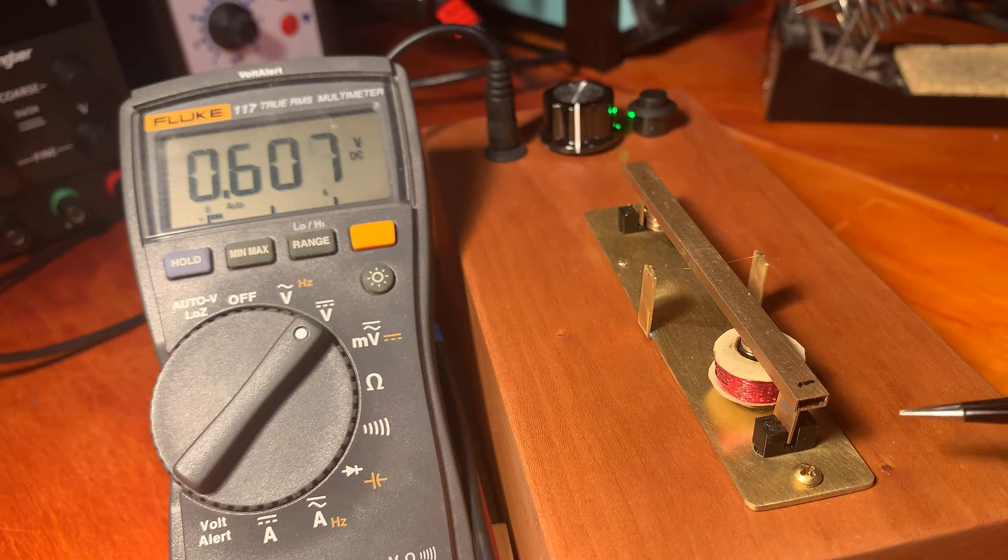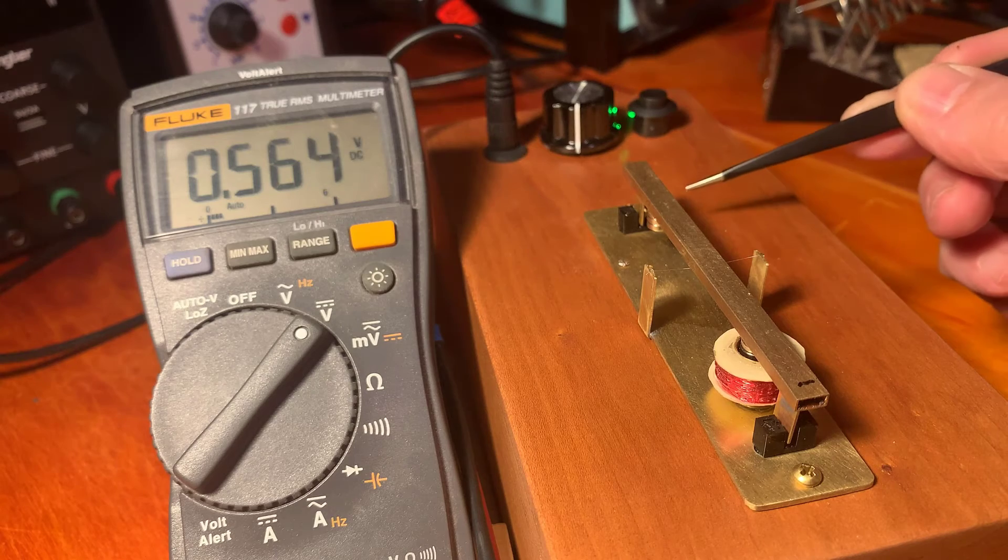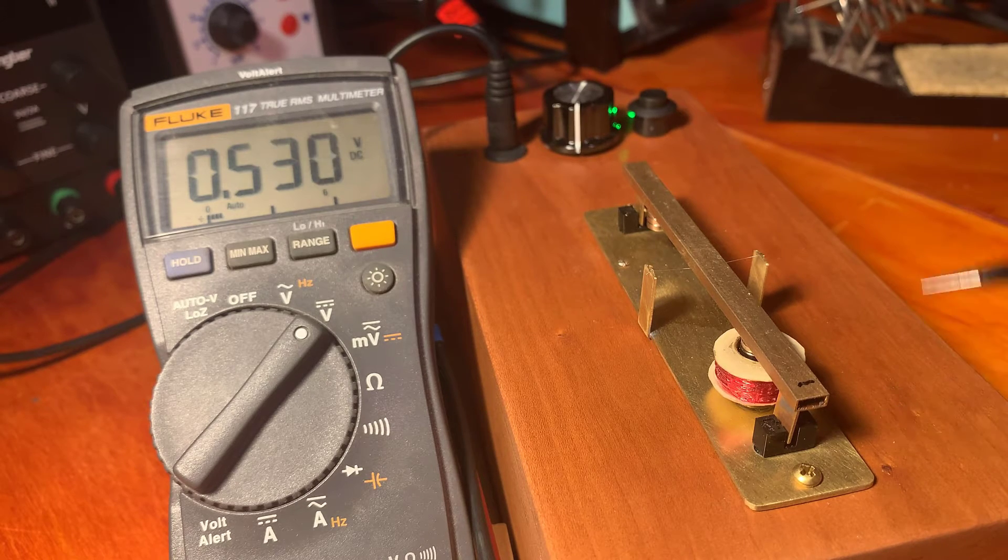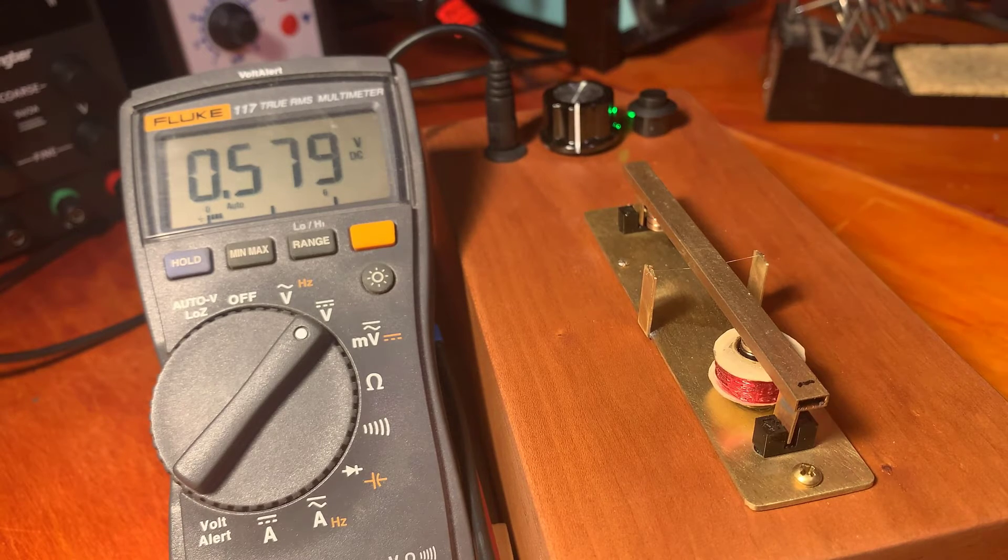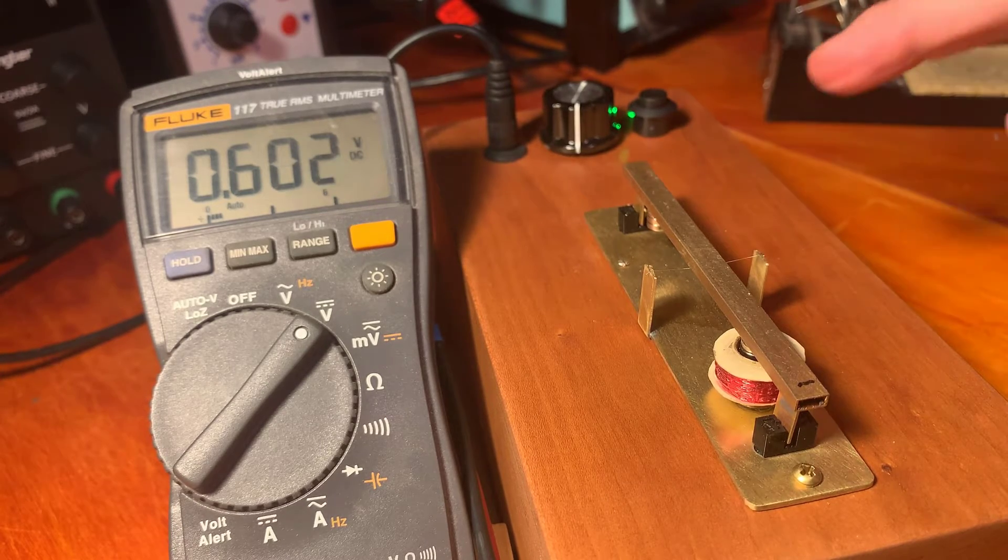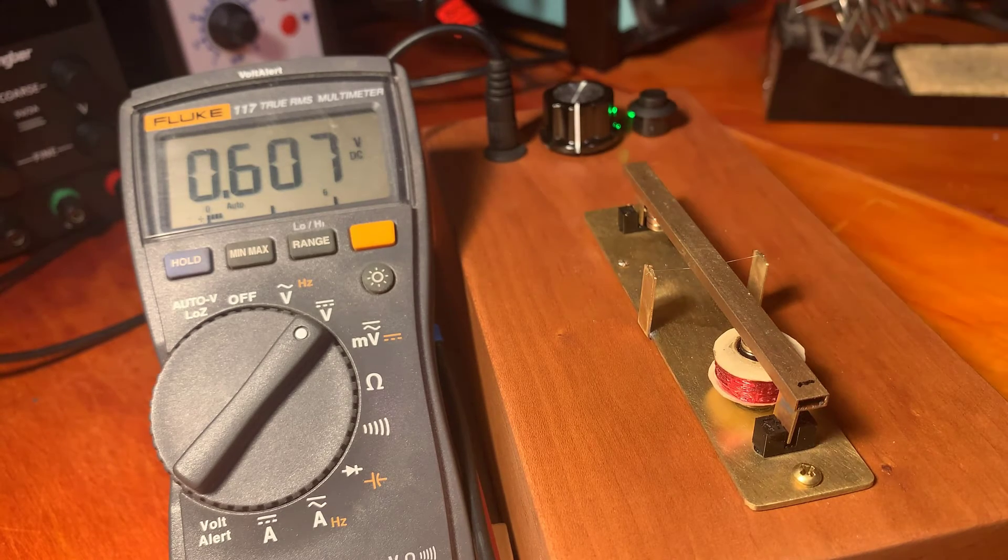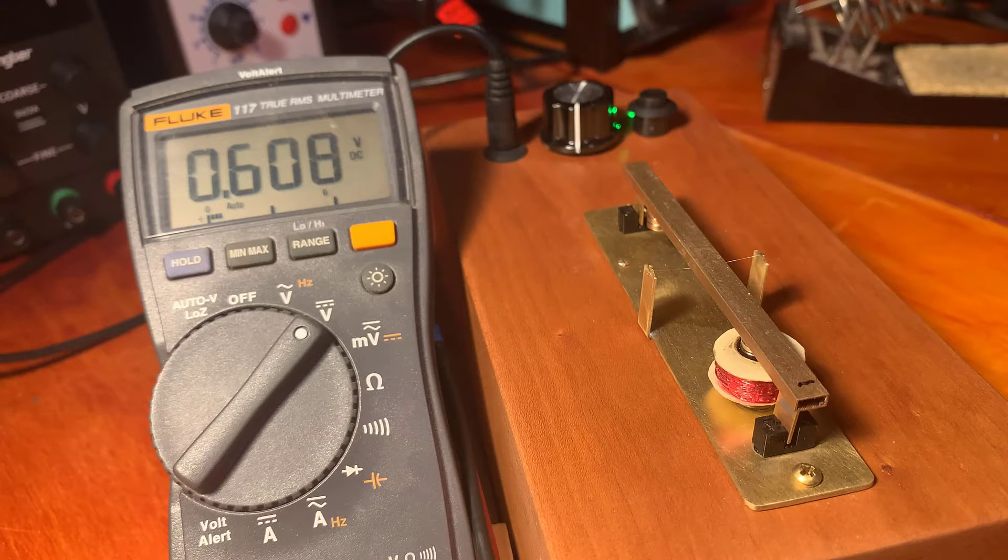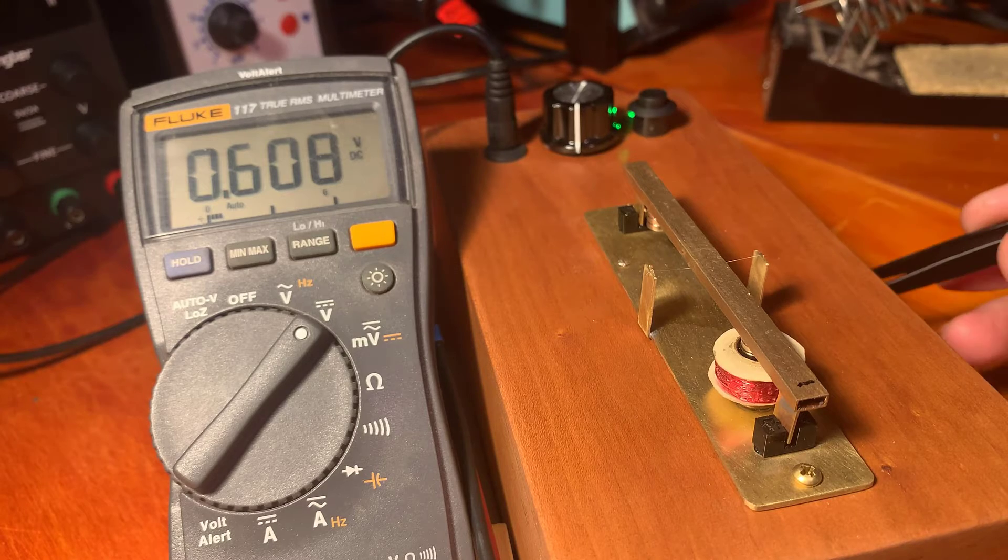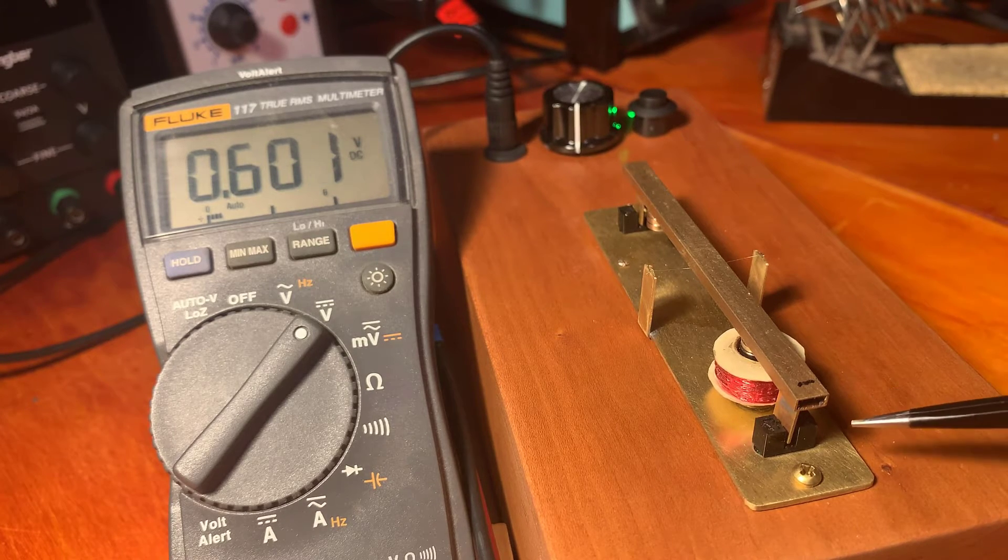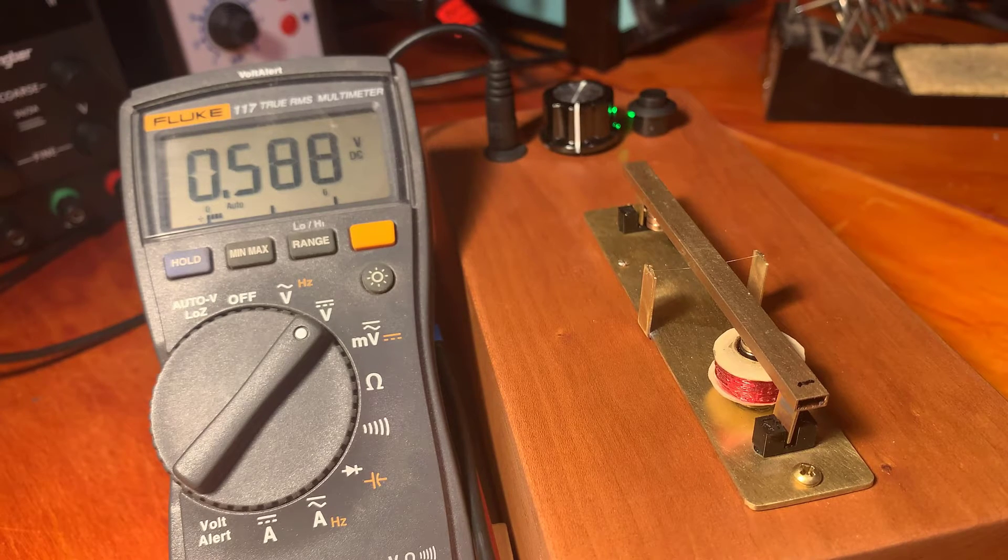And these two optical interrupters are in a differential configuration. And when they are at zero, the thing is perfectly balanced. So when the difference in voltage out of those two things is zero, it's in balance. So there's a circuit board inside of here that's driving the signal from those two interrupters to be zero at all times.